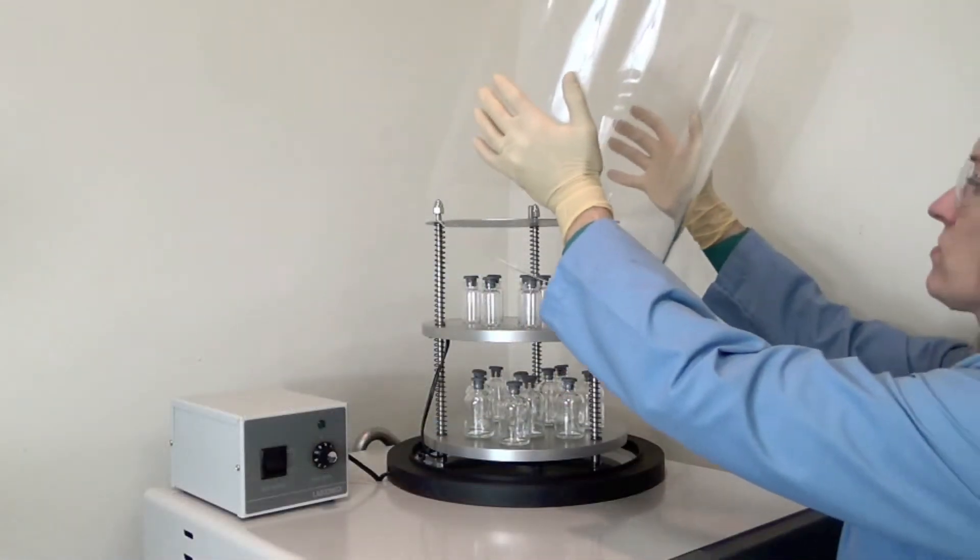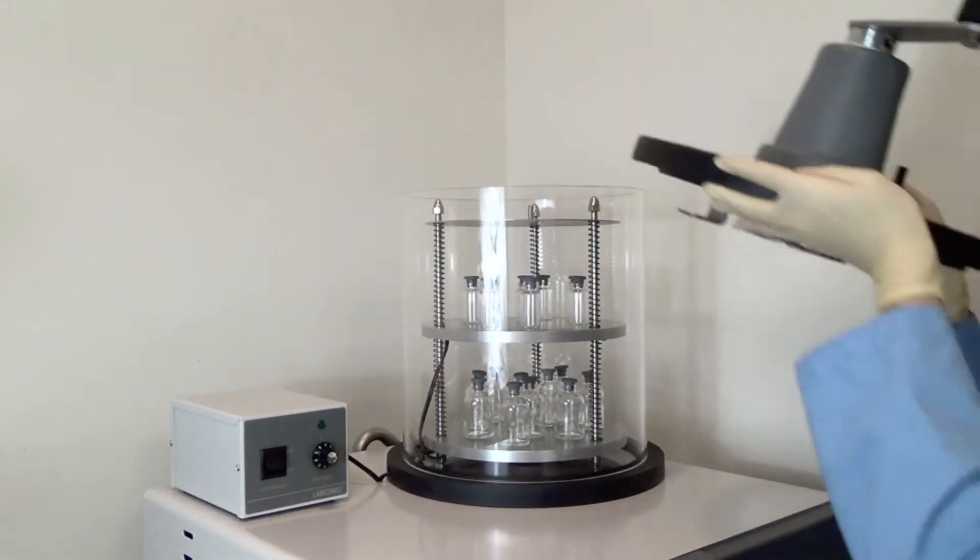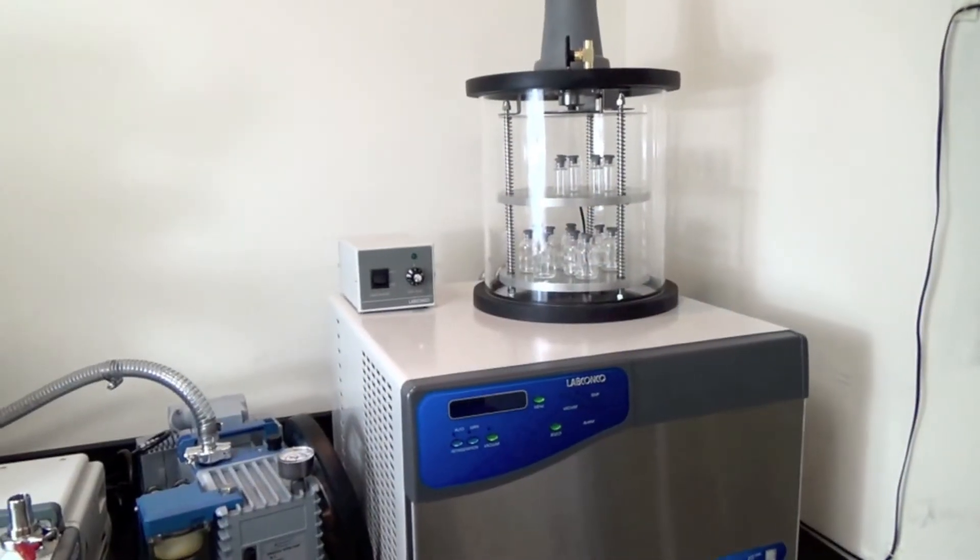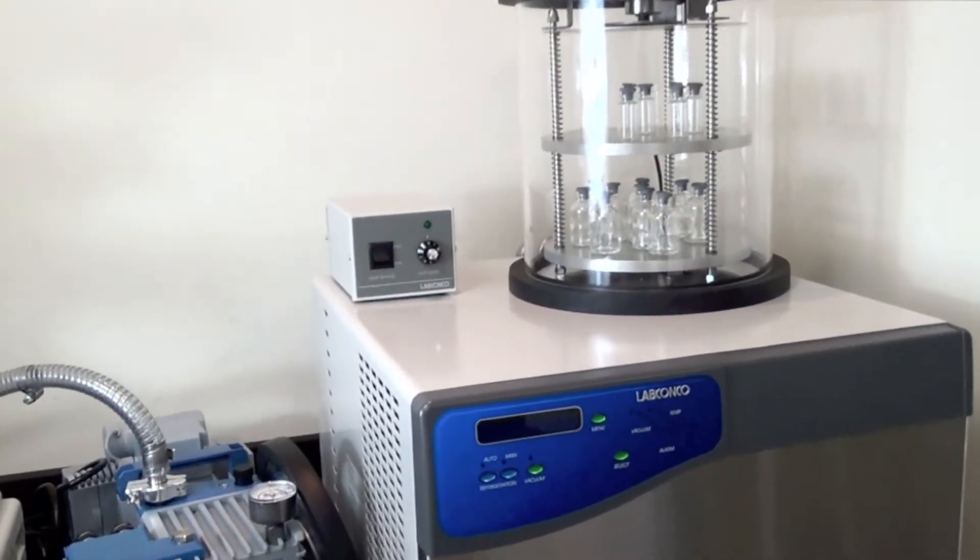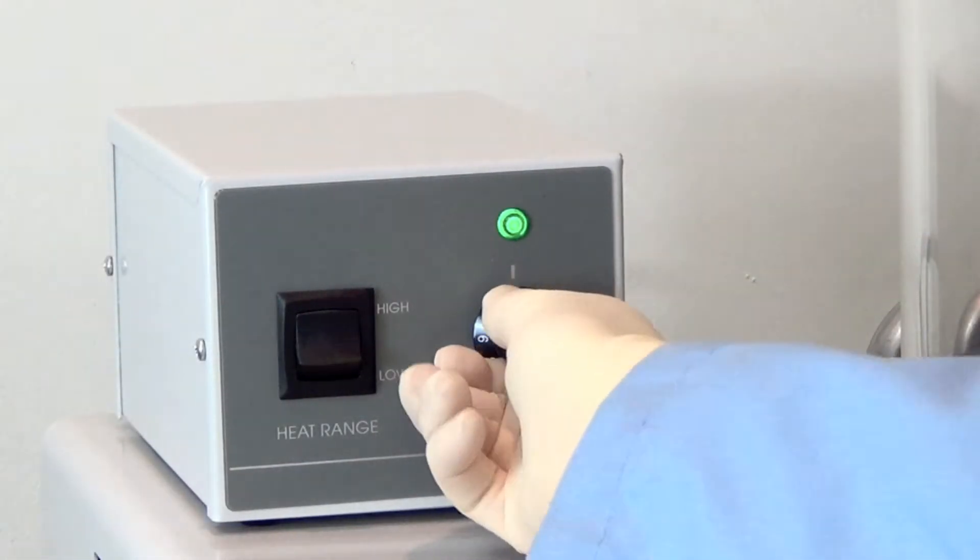When the samples are properly arranged on the shelves, replace the acrylic chamber and lid and start the vacuum pump. As the samples enter secondary drying, the use of the product heater will help remove bound water to continue the sublimation process.